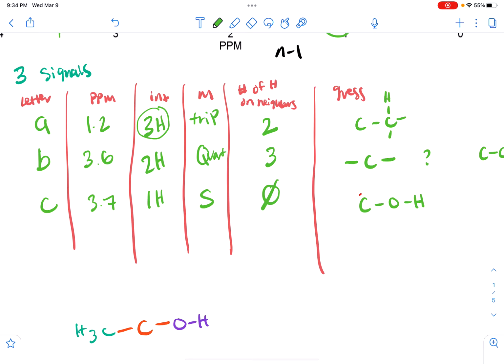And so with that, we can say CH3, so this is going to be a methyl group with 2 hydrogens on the neighbors. So it's attached to something with 2 hydrogens. We can't confirm it's a carbon, but we can infer that it's a carbon, and that's going to have 2 hydrogens, and then that would be the other bond that connects somewhere else. We don't know. So this is going to be an H here as well, and an H here as well.